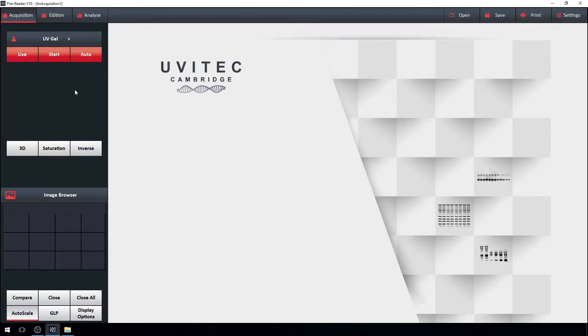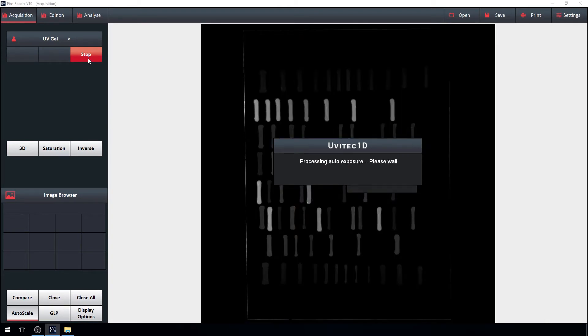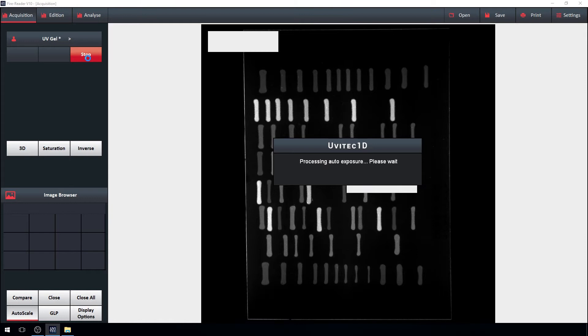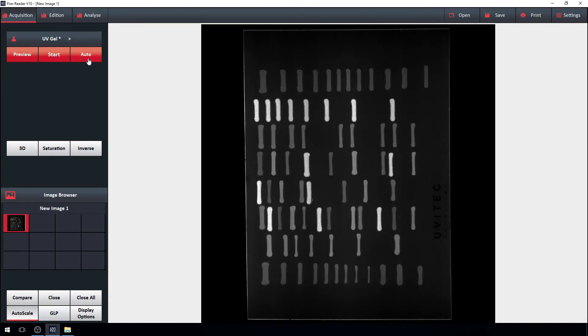The one-click acquisition process is a fully automated mode. The system calculates the optimal exposure time and applies this to the gel capture. Picture is then delivered in seconds.